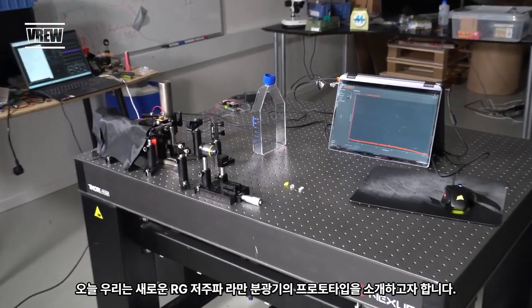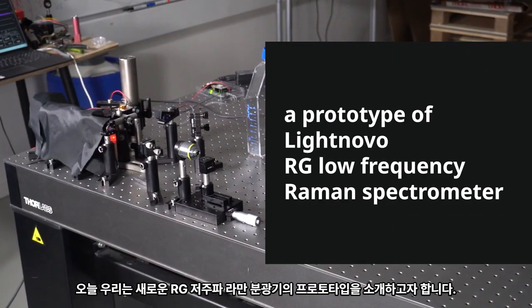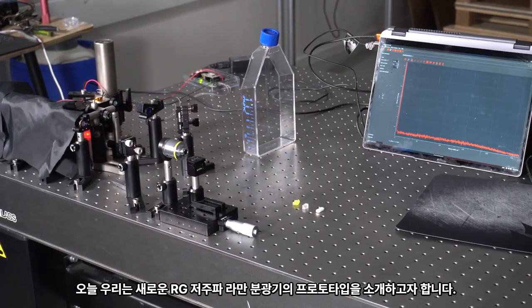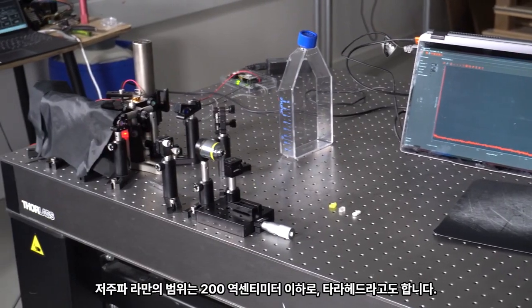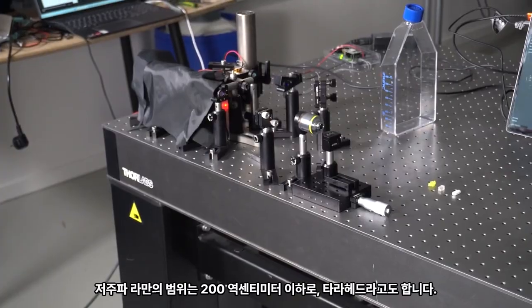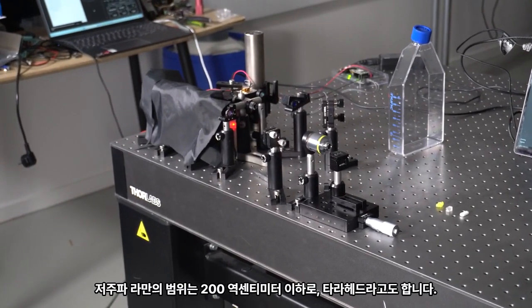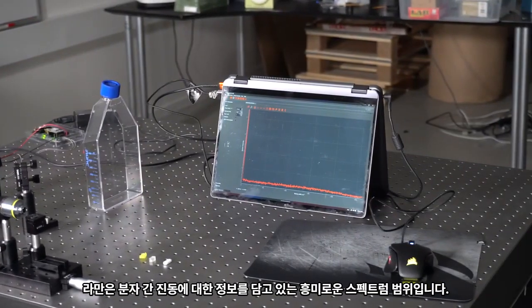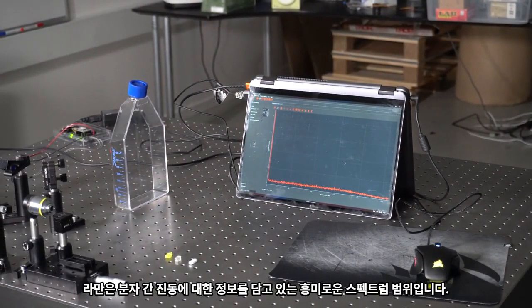Today, we would like to introduce a prototype of Lightnovo RG low-frequency Raman spectrometer. Low-frequency Raman range below 200 inverse centimeters, also known as terahertz Raman, is an exciting spectral range containing information about intermolecular vibrations.